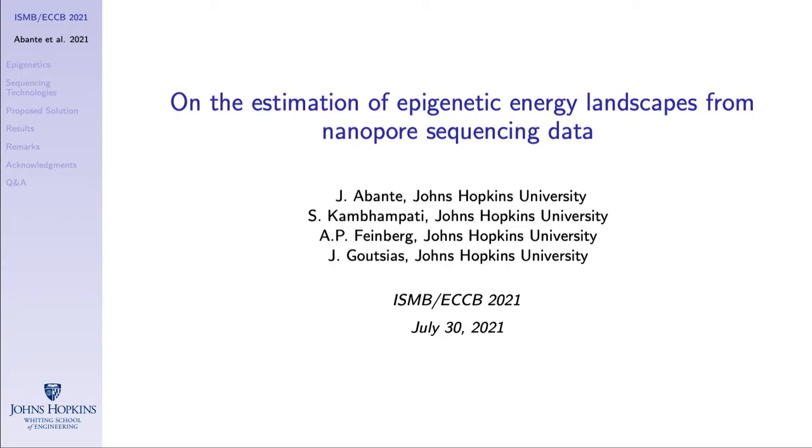During this presentation, I will go over our recent work on a computational method for estimating epigenetic energy landscapes from nanopore sequencing data. Since I imagined there would be a myriad of backgrounds among us, I thought it could be useful to give a few basic notions about epigenetics and DNA methylation so as to provide some context.